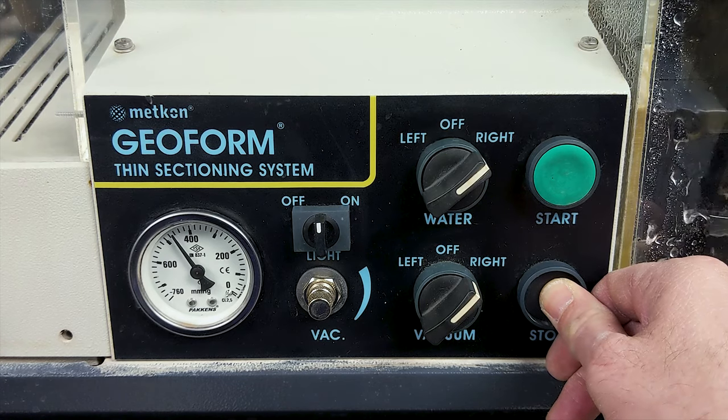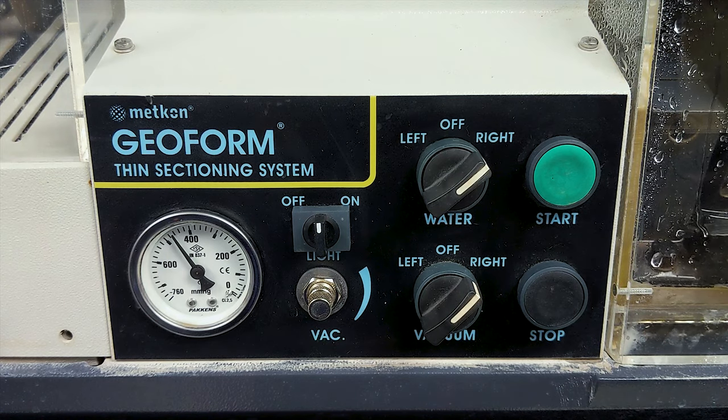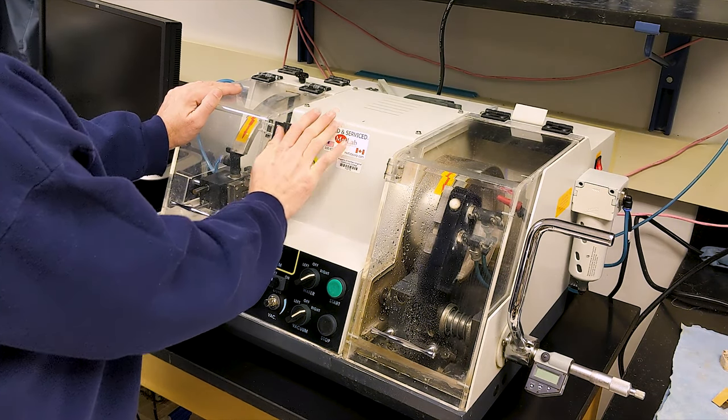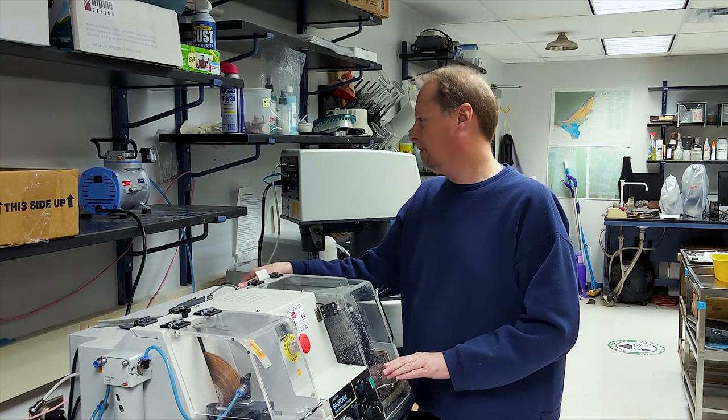And as with the ForzaPole, should something go wrong and you need to immediately stop the operation, an emergency shutdown button is readily available to bring the operation to a halt.